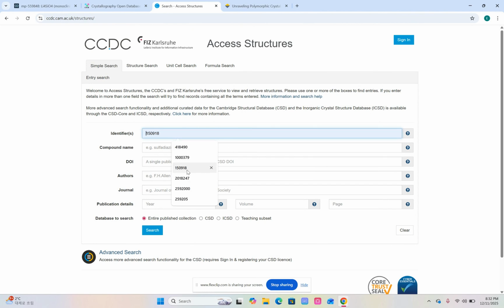And as you can see here, I was busy the last few days with refinements. My recommendation actually, because as you can see here, you have just a random number, is to ask AI, and whether AI can provide you the corresponding number for looking for at COD or here at the Karlsruhe database.